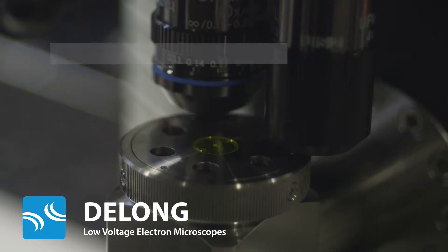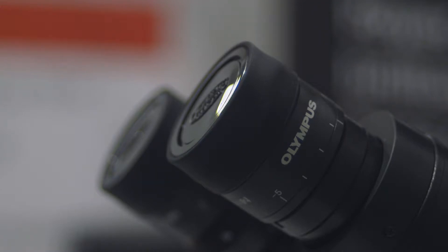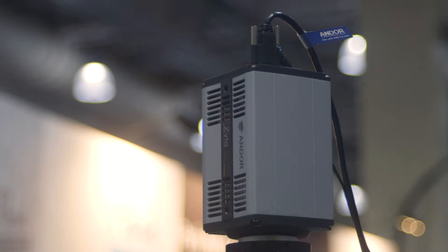DeLong is the leader in low voltage electron microscopy, stemming from over 60 years of experience in high vacuum technologies and over a decade of experience in producing electron microscopes with low voltage field emission guns and permanent magnet lens systems.